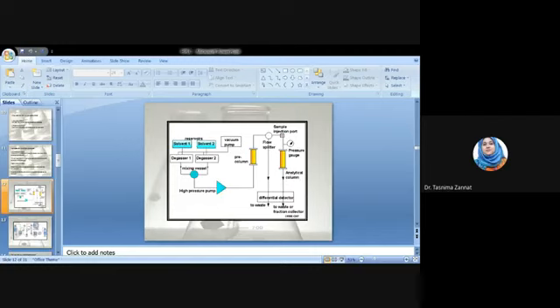The typical pumps can reach pressures in the range of 6,000 to 9,000 psi. This is actually the pressure of the pumping machine. In psi it is 6,000 to 9,000, and in bar it is 400 to 600 bar. During the chromatographic experiment, a pump can deliver a constant mobile phase composition, like isocratic, or an increasing mobile phase composition, like the gradient. I think you have an idea about the isocratic and gradient elution technique from my previous lecture.